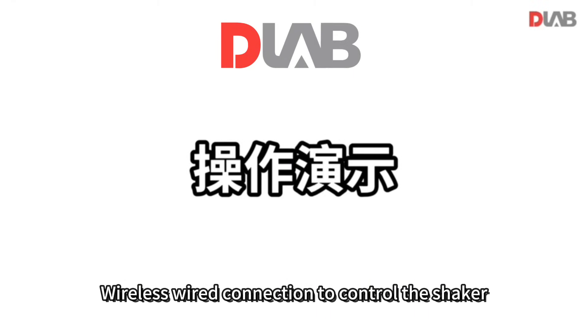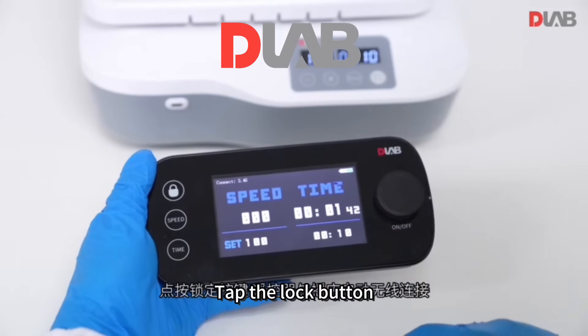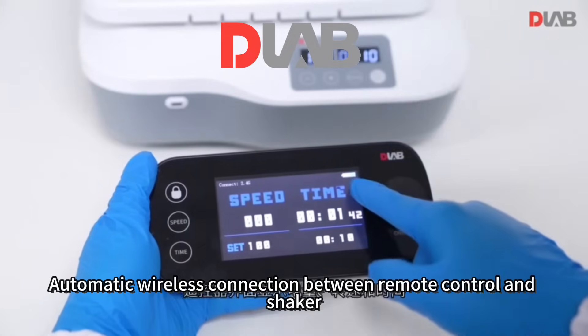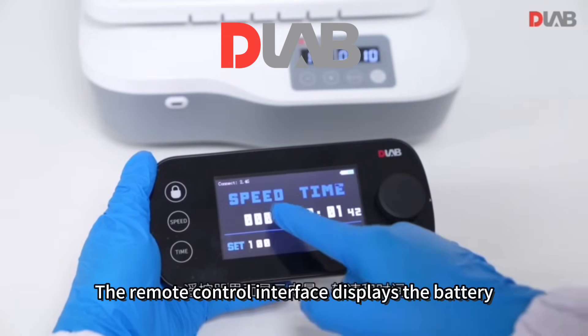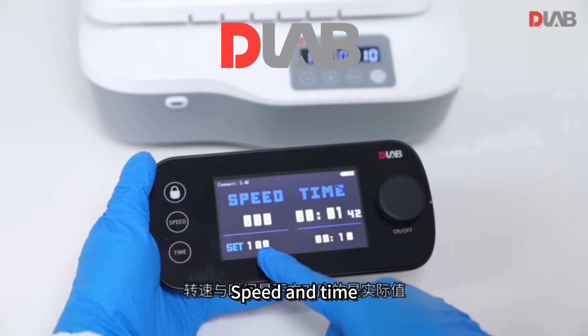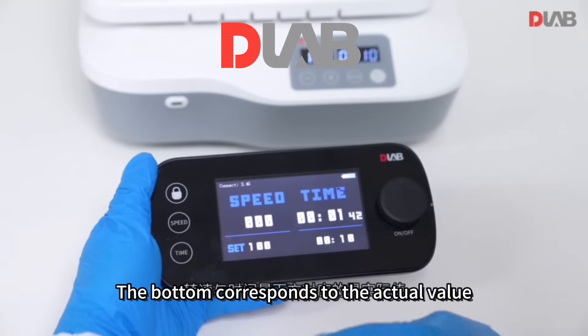The shaker supports both wireless and wired connection. Tap the lock button for automatic wireless connection between the remote control and the shaker. The remote control interface displays the battery level, RPM, and time, with the bottom row showing the corresponding actual values.